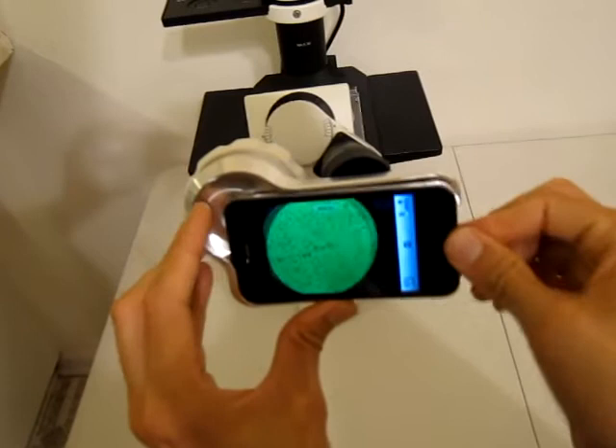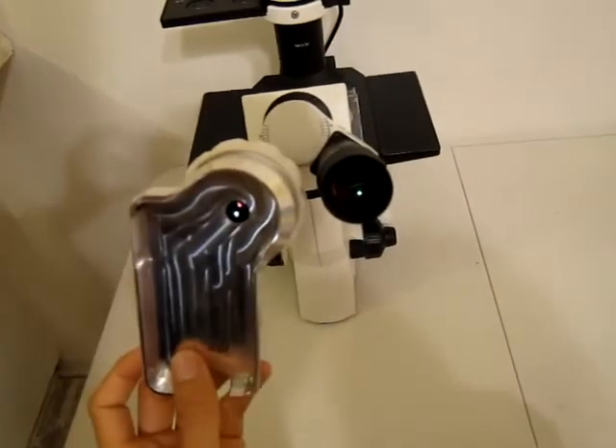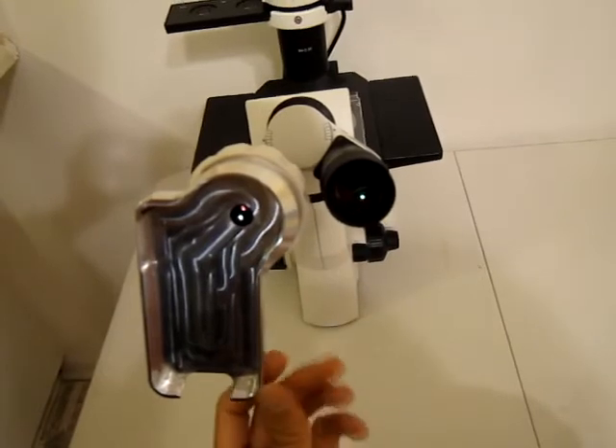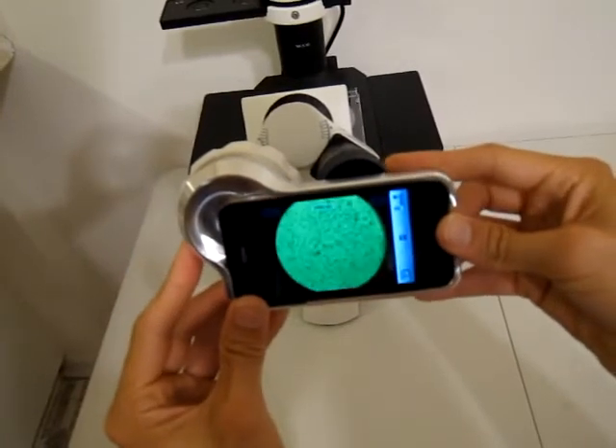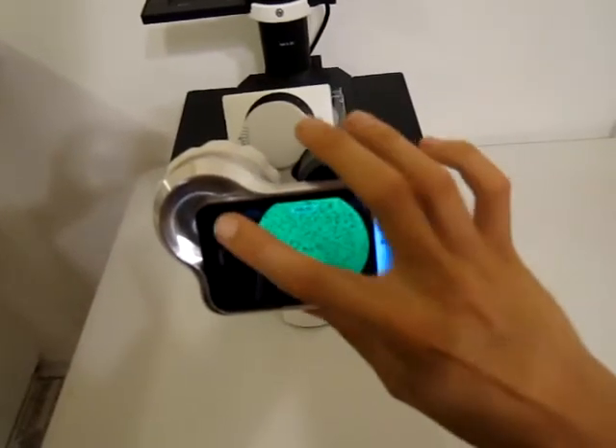If you want to just use the eyepiece, you can use the eyepiece on the right side by turning the adapter out of the way and then using your eye there. Turn it back and put the iPhone back in.